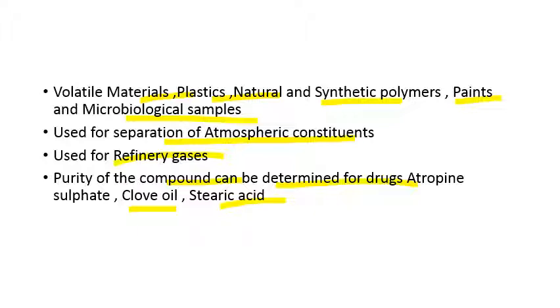So you have seen a wide application of gas chromatography, and we can take advantage of this type of analysis for our samples.